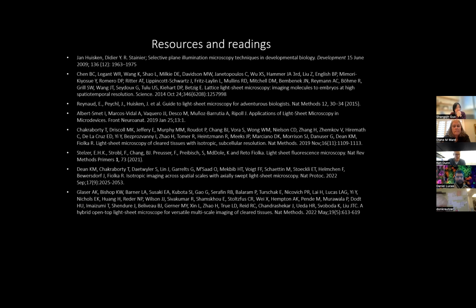I'd recommend that you check out some references to find out if anybody has successfully managed to do that. People clear bone. I don't know if they clear bone to the degree that the calvarium is well imaged. Certainly not imaged at the kind of quality that your work has. And the other issue is going to be getting your antibodies or any other reagents into the tissue. So I can't really comment on that. Okay, thank you. Sure.